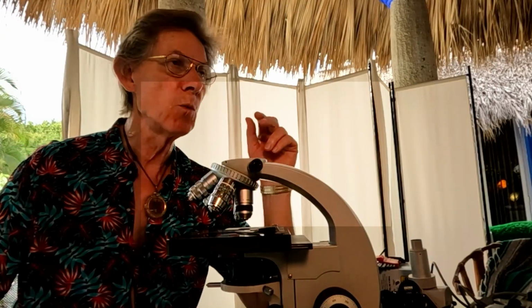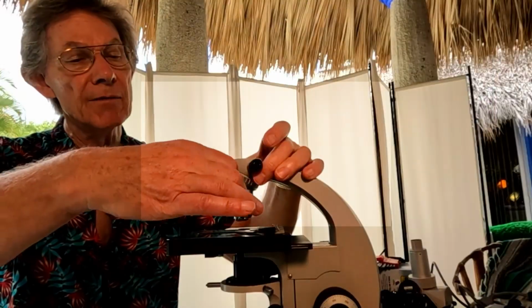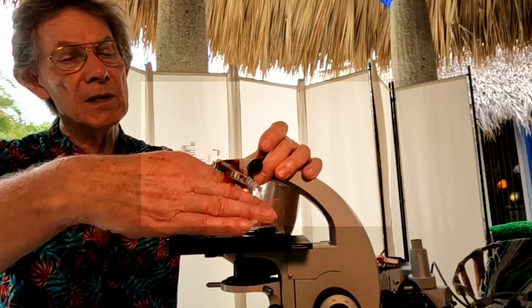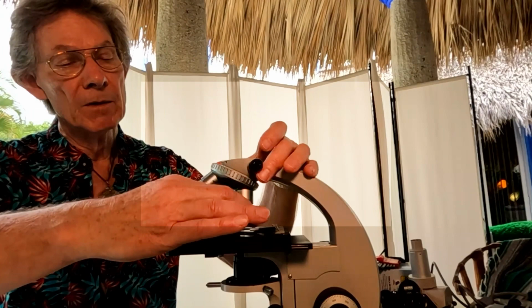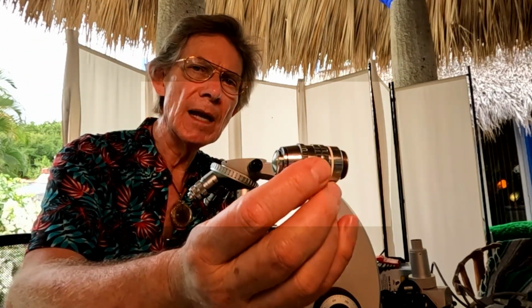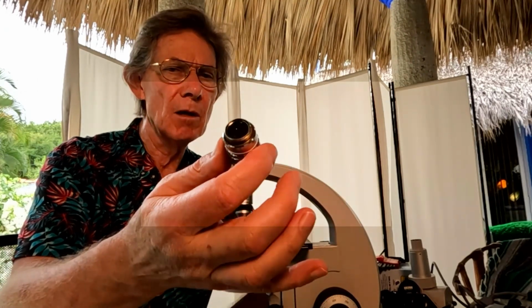This particular microscope lens here, which is the 100 power, cost about $5,200 for this one piece of glass. Now, it's not one piece of glass, it's numerous lenses stacked upon each other to allow it to do what it actually does. I'm going to take it off so people can see how these things fit together. If we take off this lens and look at it, it doesn't look like much, really, but that's over $5,000 worth of technology right there.